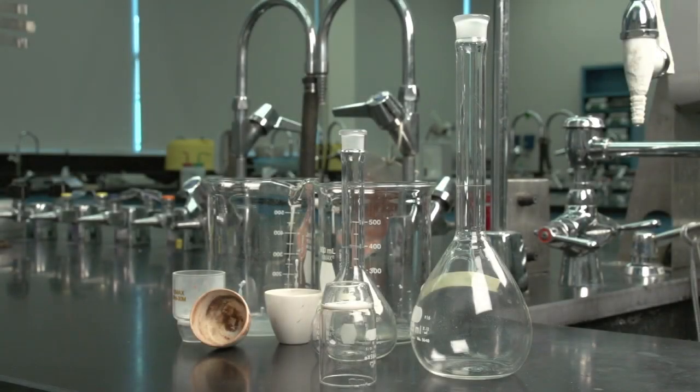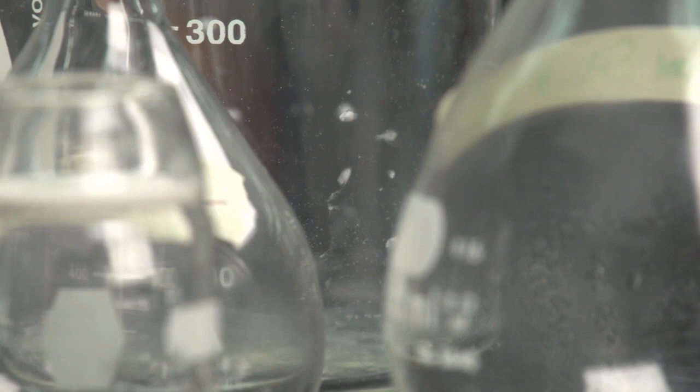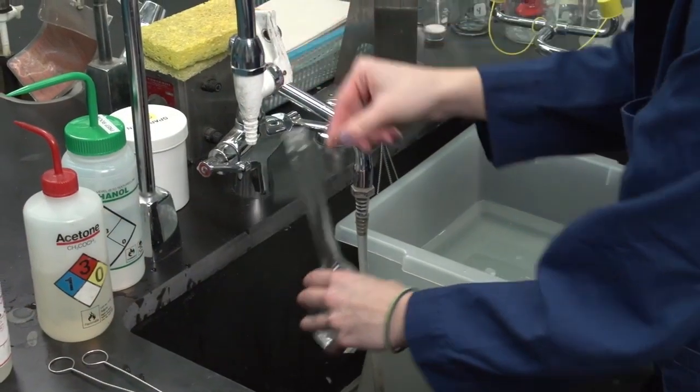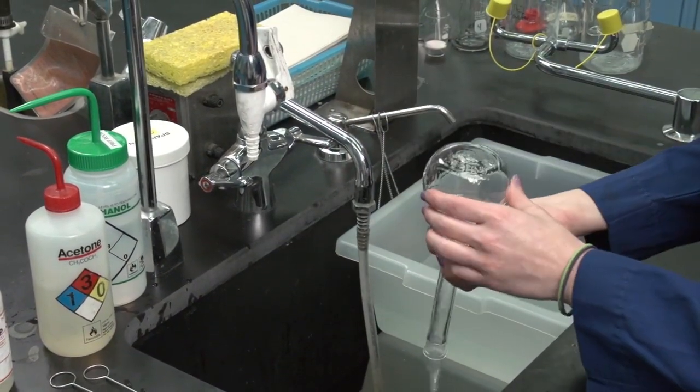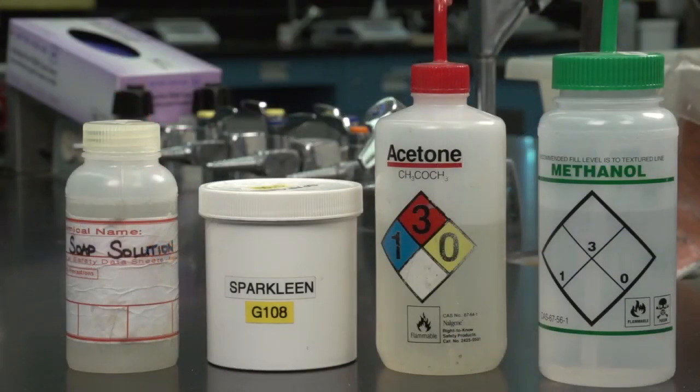Dirty glassware is one of the leading causes of experimental errors. Often glassware appears to be clean, however it may be chemically dirty. Traces of ions, soluble substances, or different solvents cause errors that can be prevented with some extra effort during washing and rinsing. Soap, detergent, or abrasive powder may be used for washing glassware.